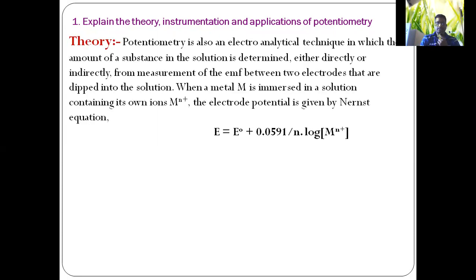Hi students, in the last session we discussed conductometry. In this session, let us discuss potentiometry. The type of question asked on this is: explain the theory, instrumentation and applications of potentiometry. So let us take the theory of potentiometry here.